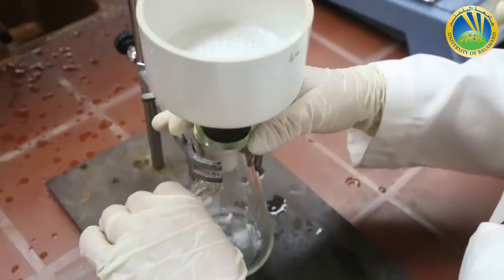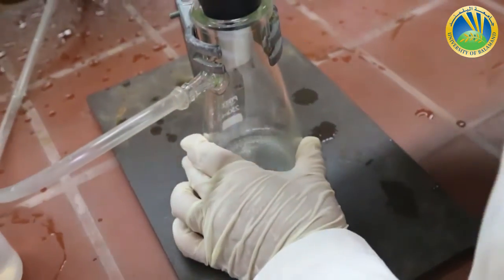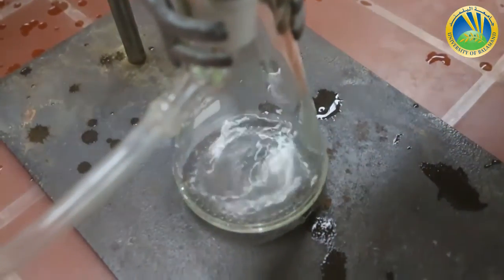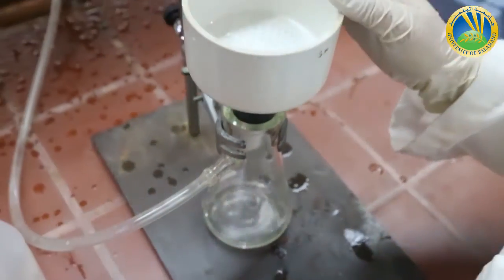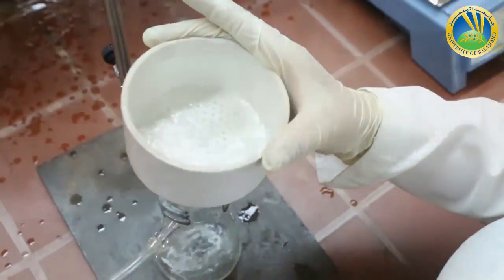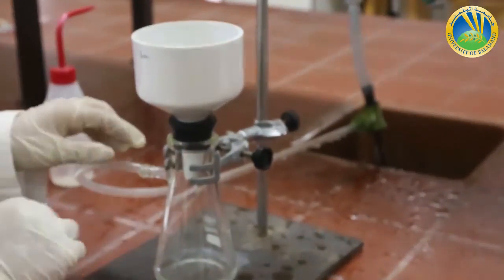I will leave it for a few more seconds to let all the water go into the Erlenmeyer, to let the filter paper dry as much as possible. Now all the water is inside the Erlenmeyer flask.